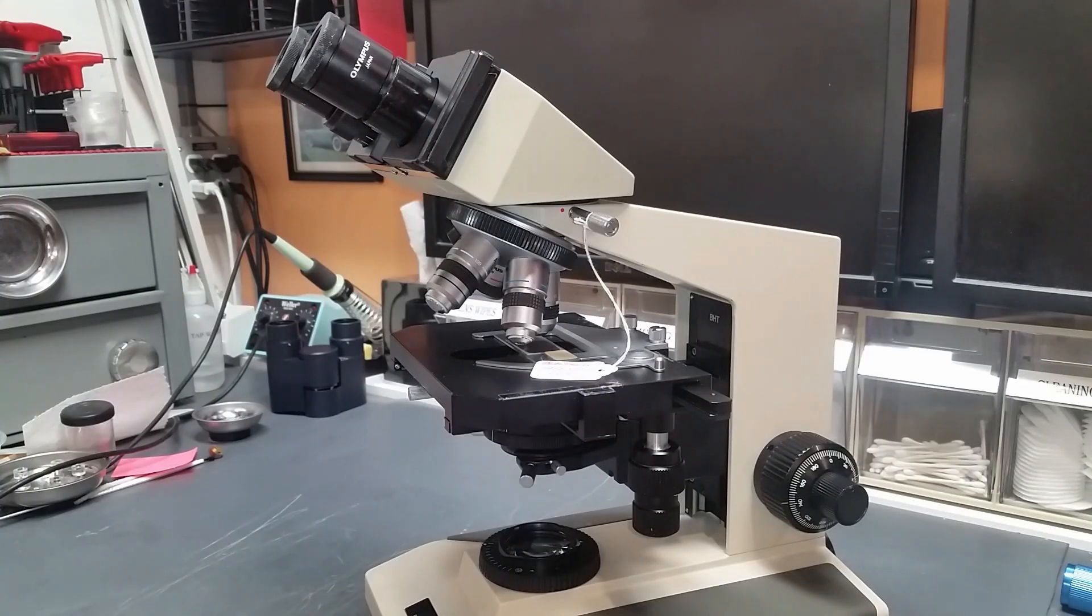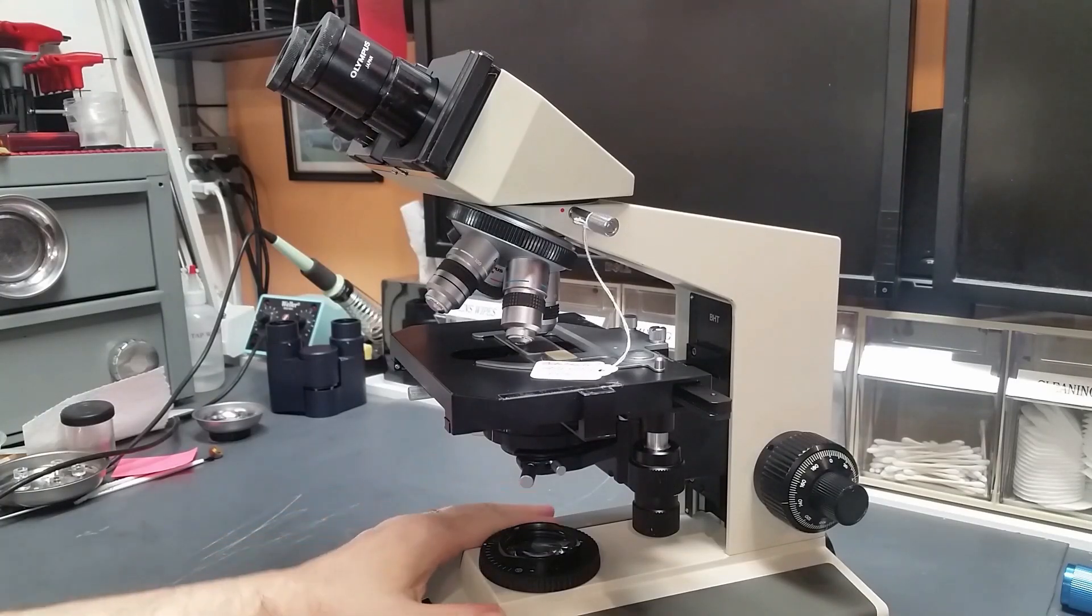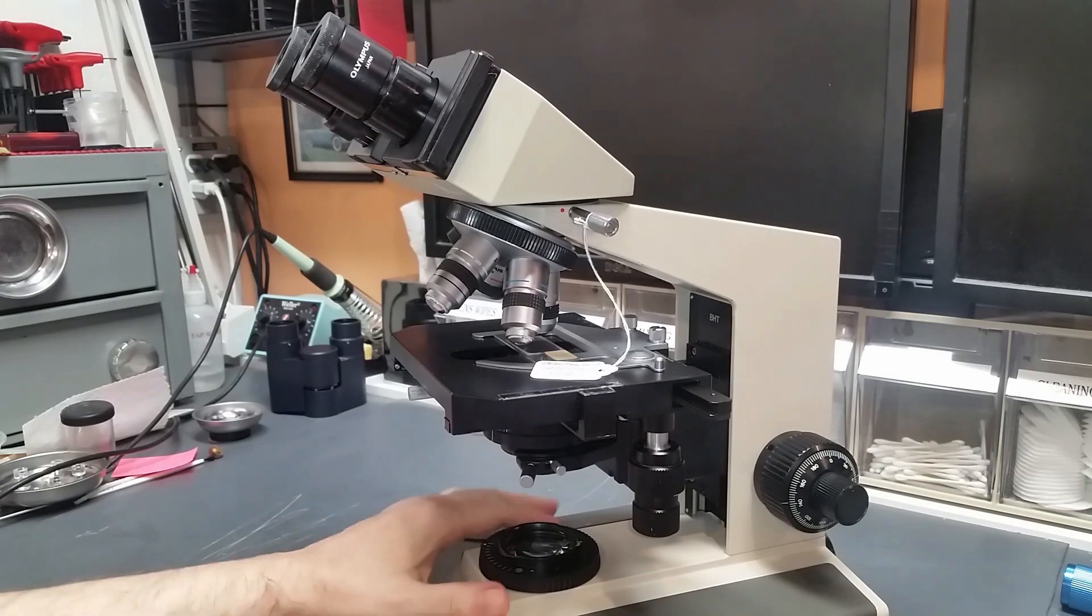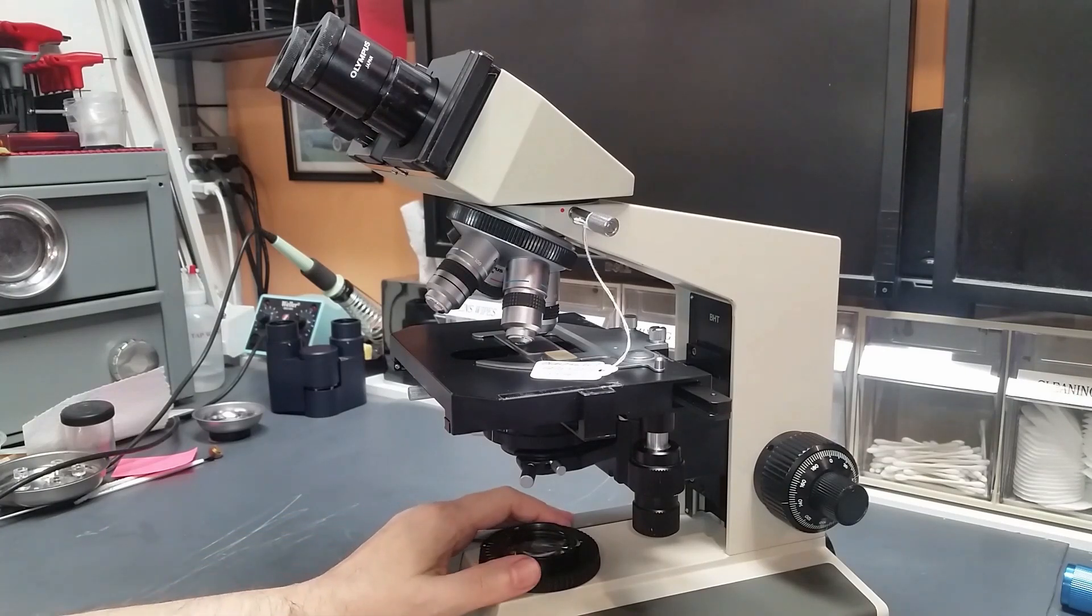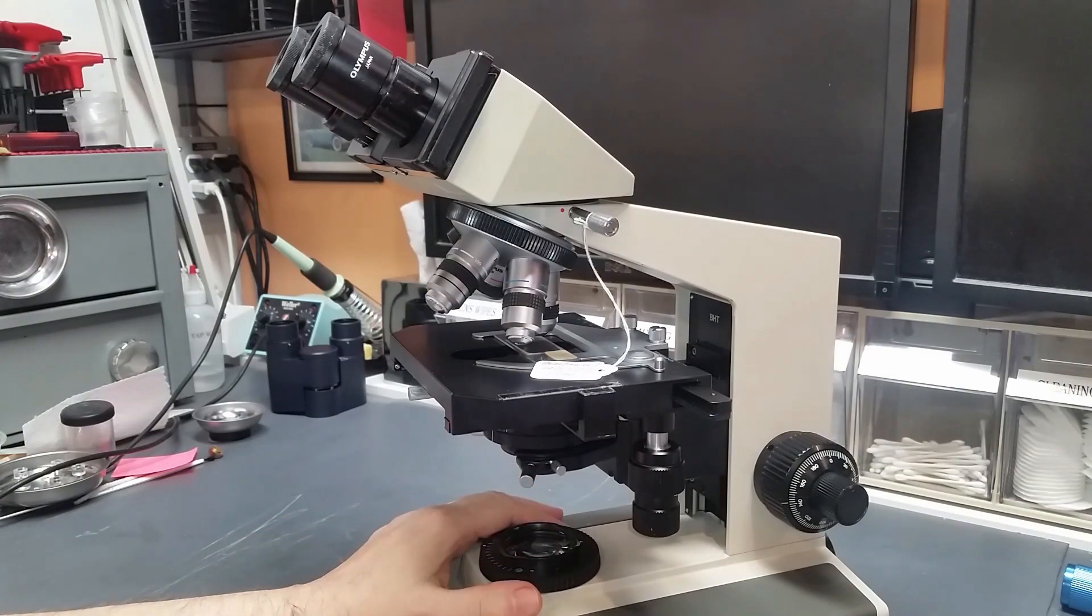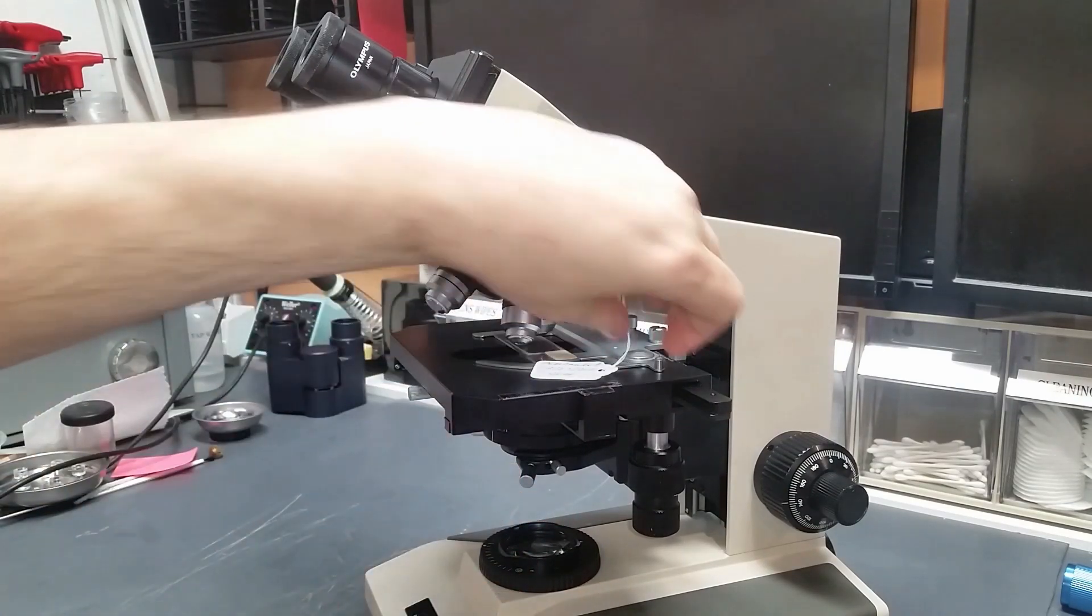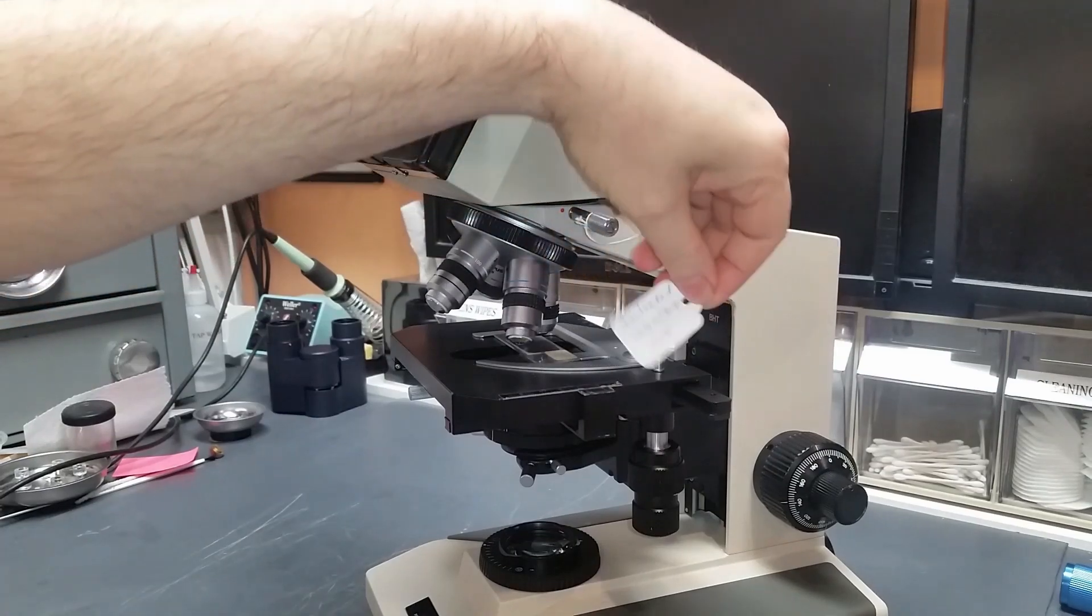Hello, welcome back to the Empire of Dirt workshop. Today I've got an Olympus BHT scope. This is a scope that I recently overhauled.